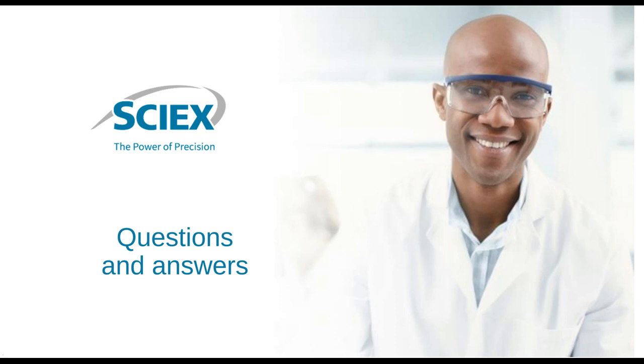Sure, not a problem. Thank you very much. We have a question related to analysis time. What is the shortest analysis time, including preconditioning and rinsing, for a single sample? Conditioning at the start of a run is probably in the 10 to 15 minute range.